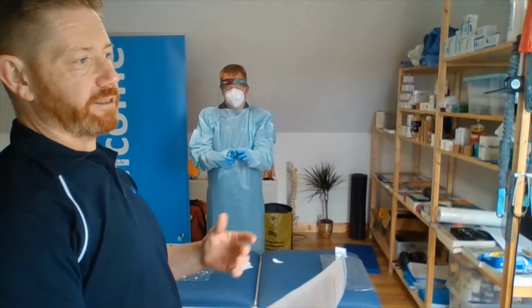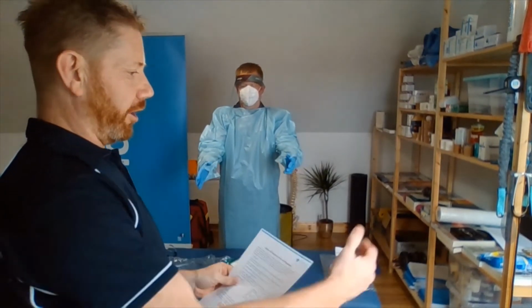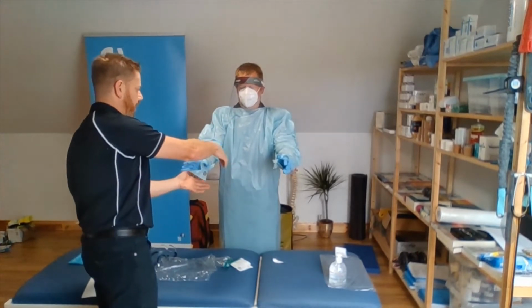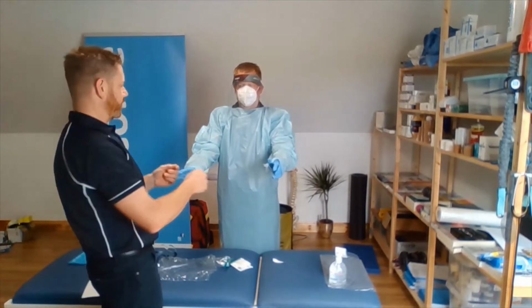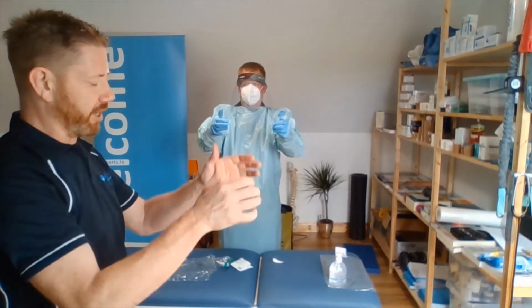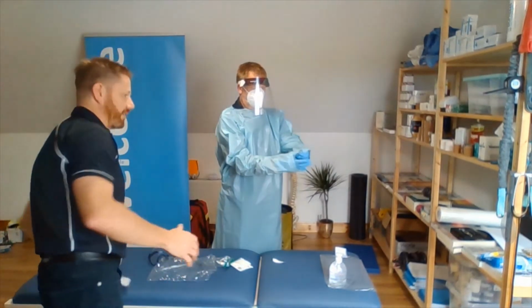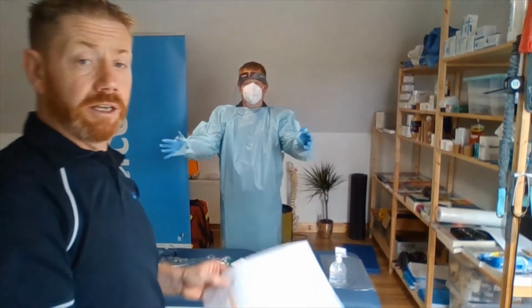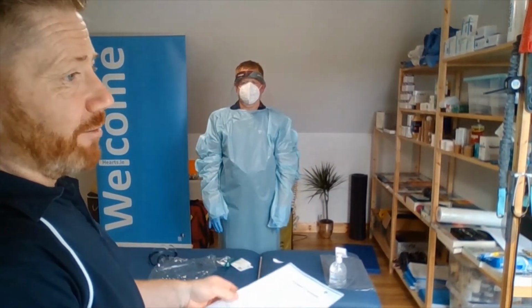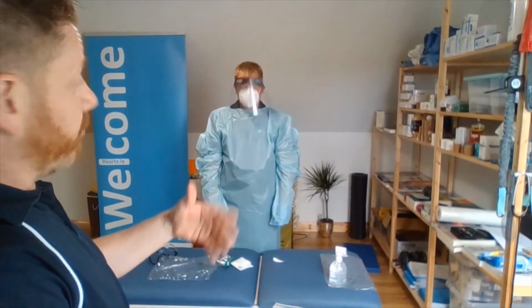So in some cases, particularly in hospital direct care settings where you might have very close and direct contact, there might be some form of taping up here as well, with gloves on and with mask on. Or else, as you can see, Sean has used the little thumb inserts there to hold the gown in place to stop it moving up along the arm. So, as we mentioned, that's putting on the equipment, or the technical term that's used in healthcare, donning. Okay, so we go straight into doffing, which is taking off.